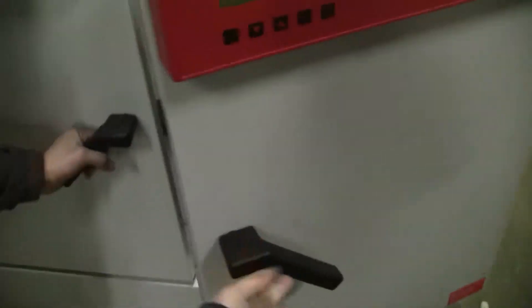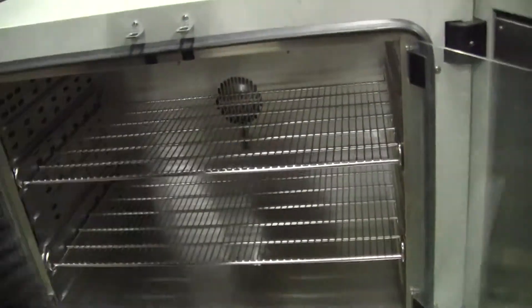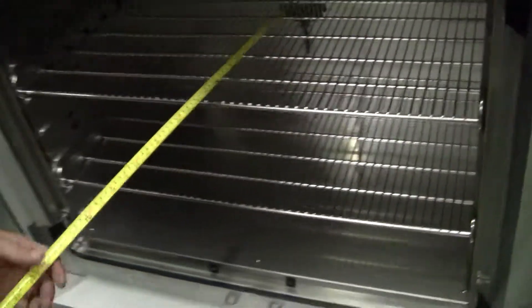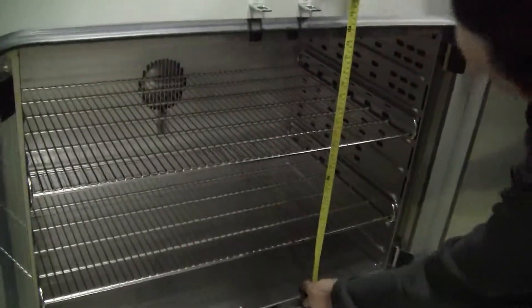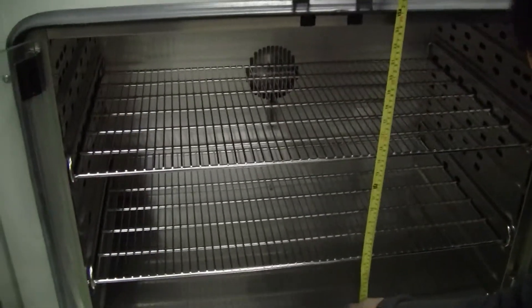Let's take a look inside. Chris is going to measure the rack system in there. That is about 18.5 by 31, and the height is just under 24 inches.